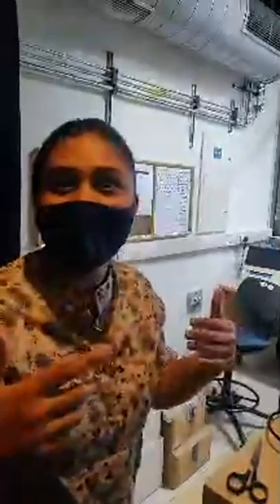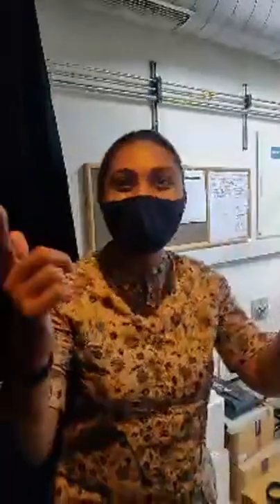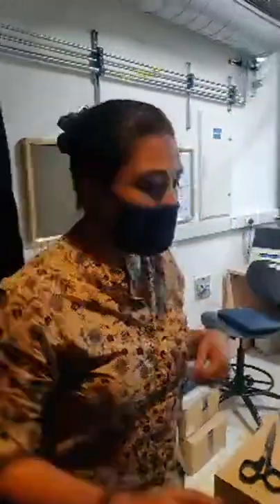So it's like a VR headset that we see and we react, but you are at the same place. Exactly. You are stationary, just the world is moving around you. Oh wow. And then what happens is, when it moves and the fish gets the signal, we can record it here. Then the activity comes here. See, that grating moved and the activity came here.